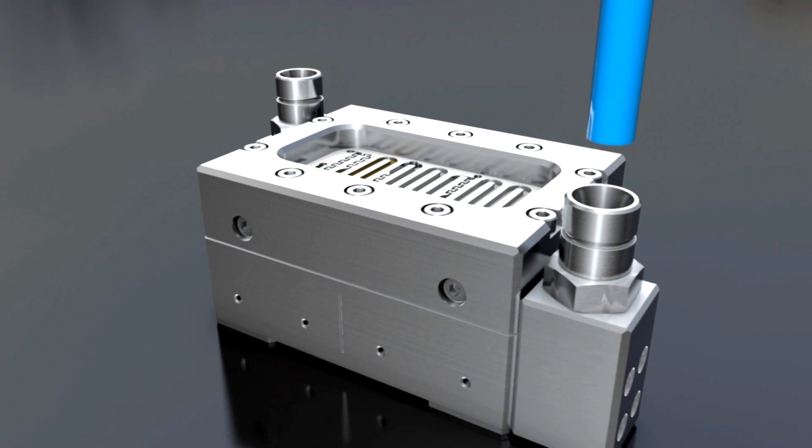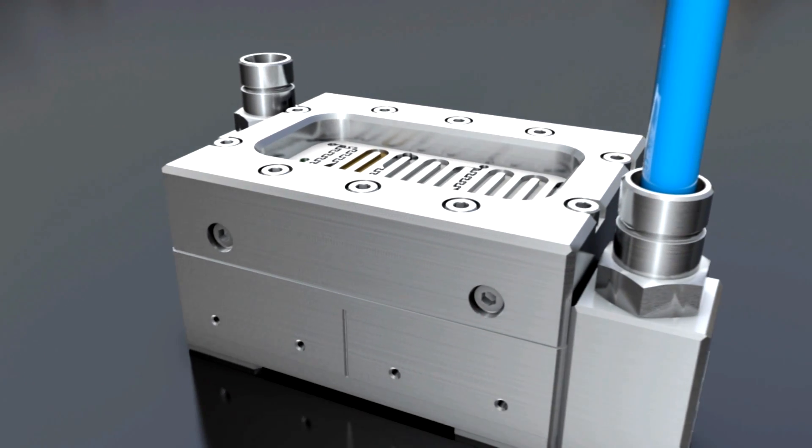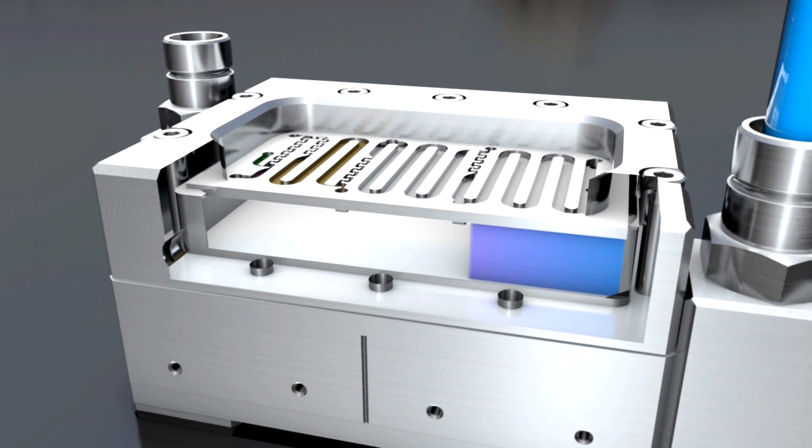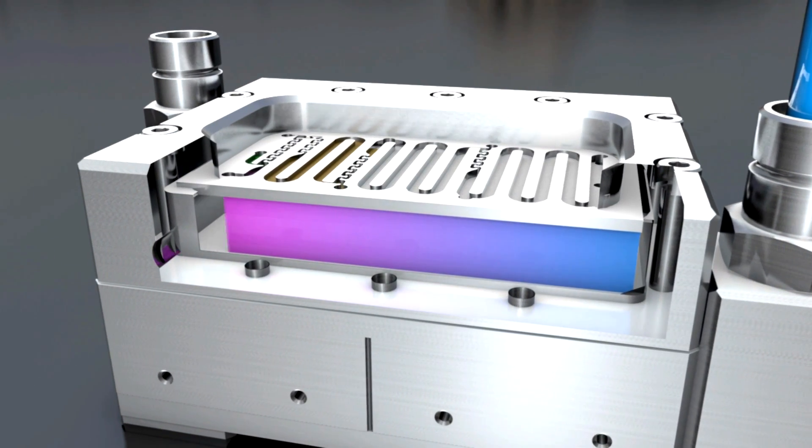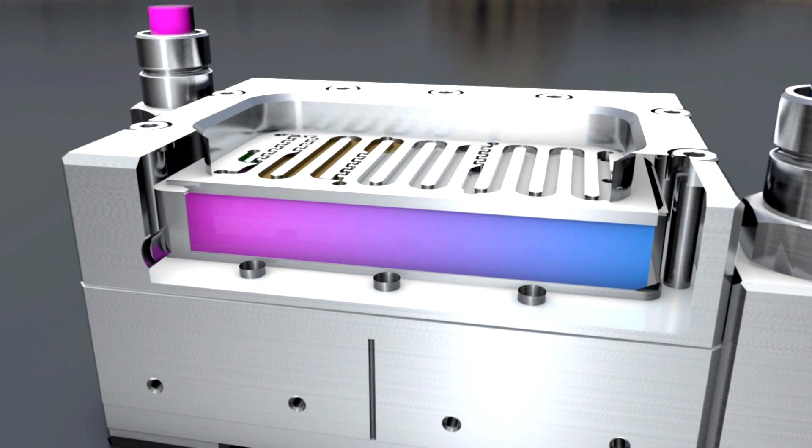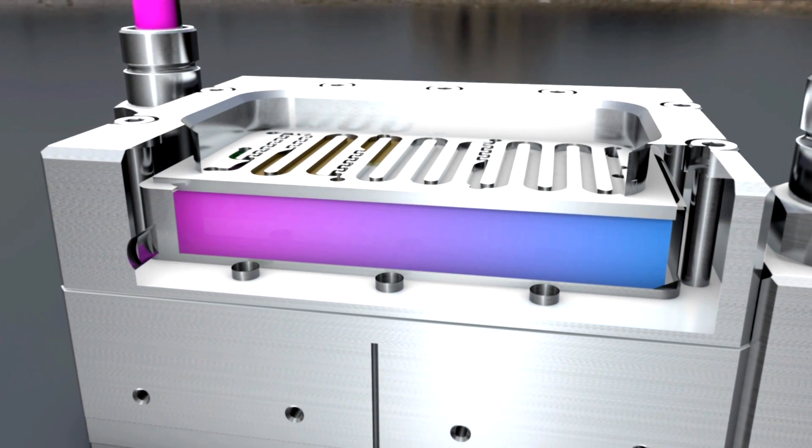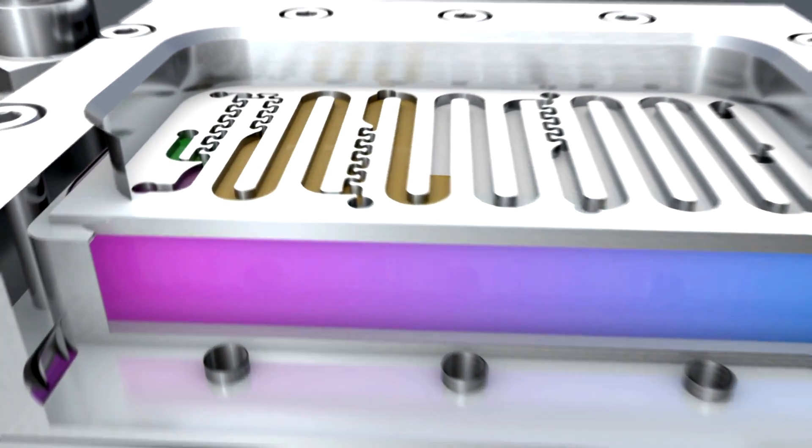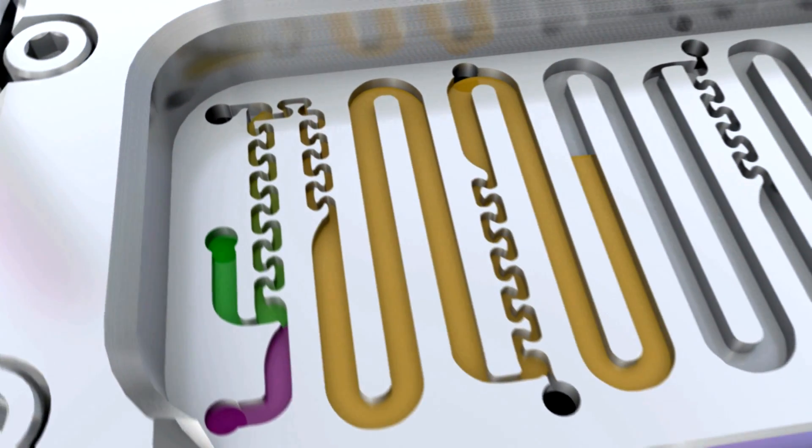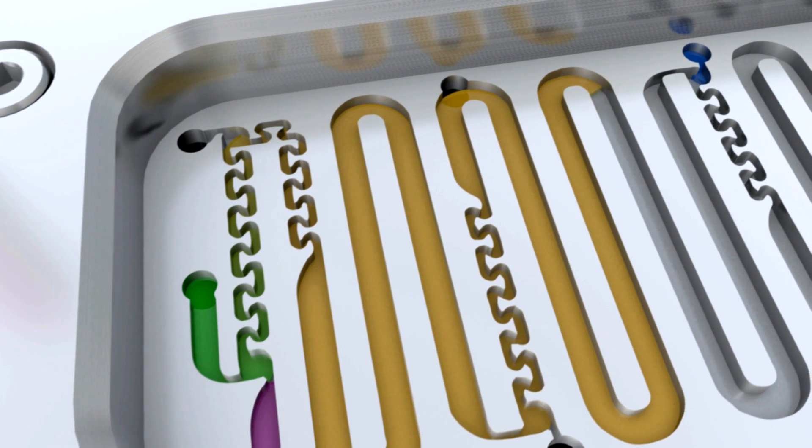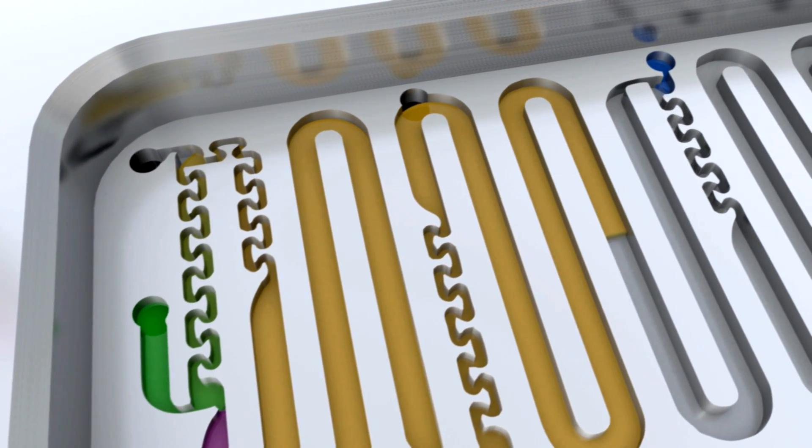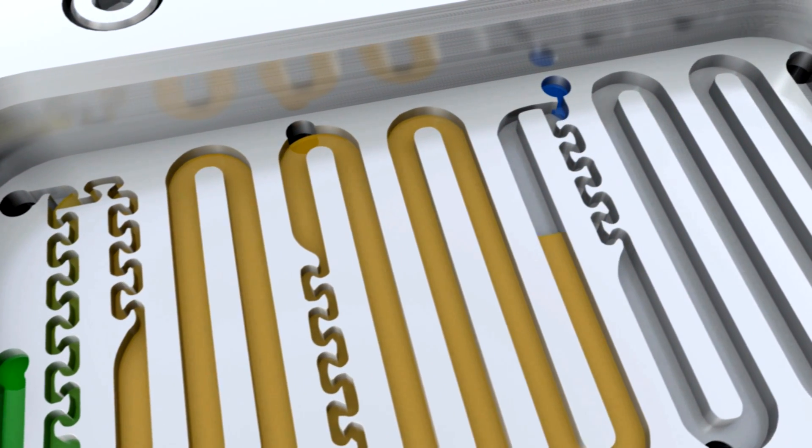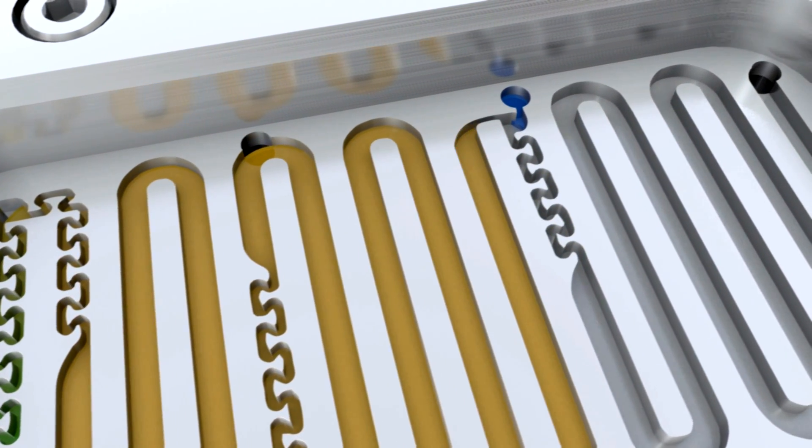In the flow plate reactor, the chemical reaction takes place in a small channel on a large flow plate that is cooled from below by a cooling agent. The large surface area ensures an optimal heat exchange. And the chemicals can be cooled with less energy than needed in a large vessel. That not only saves energy, fewer raw materials are also needed since the process creates fewer unwanted byproducts.